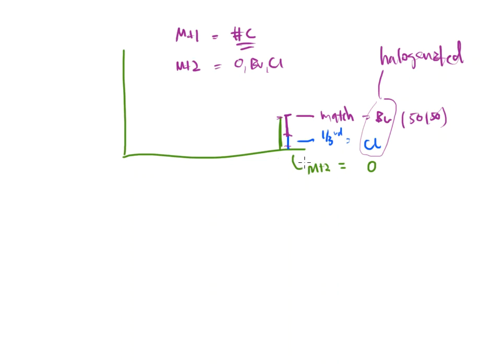All right, so something else that we can take away from the mass spectrum before we start a full-blown analysis is something called the rule of 13. Now, 13, you should automatically think of the last video when we said that carbon can come to us as carbon 12 or carbon 13. Carbon 12 is about 99%. Carbon 13 is about 1% of the time, and that's why we had that multiplier in that equation.